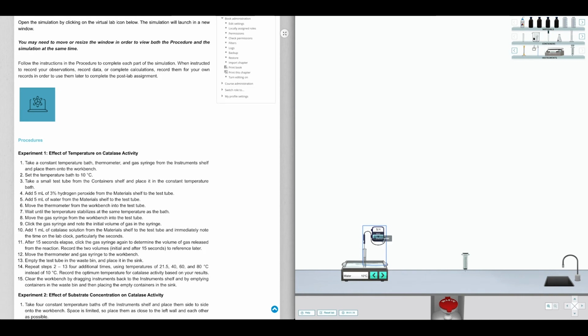See how this is Celsius and this is Fahrenheit. You can click that to change it to Celsius so that it will read the same temperature scale. As this gets close to 10 degrees Celsius, we're going to read about the next thing we're going to do.